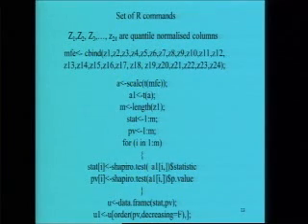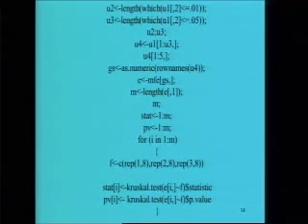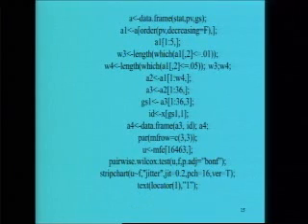So we now have for our Shapiro test all the 24 observations in each of these rows on an equal platform. And then we apply the shapiro.test on this. A single loop carries out all these 22,283 tests in less than 1 or 2 minutes. So this R software is very powerful in that sense. And on the basis of ordering, we select the top genes. On the genes for which normality is rejected, we apply the kruskal.test. And again, on the basis of pairwise test and strip chart, we identify a few genes and decide on their profiles.